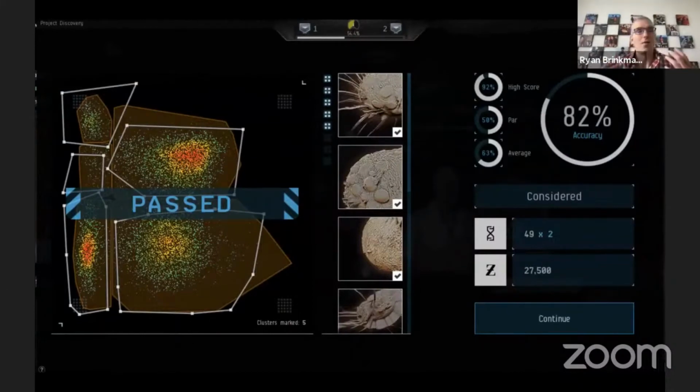Now, these people don't know anything about biology. They don't know what a T cell population is or an NK cell population. And there is no hope of ever being able to tell them the depth of knowledge that the people listening to this today have about the intricacies of why we're gating what we are and what it means and why we're drawing the gates. But the hypothesis we had is the process of gating can be done without understanding the biology behind it, because we're just trying to find patterns in two-dimensional plots at the deepest level.